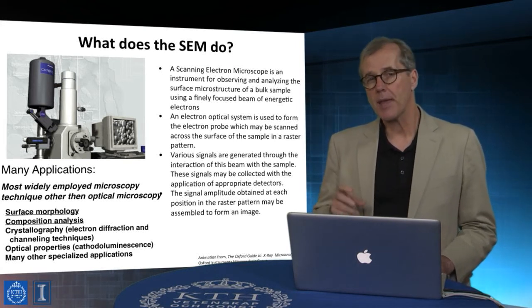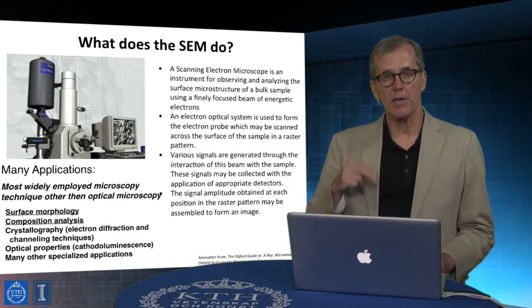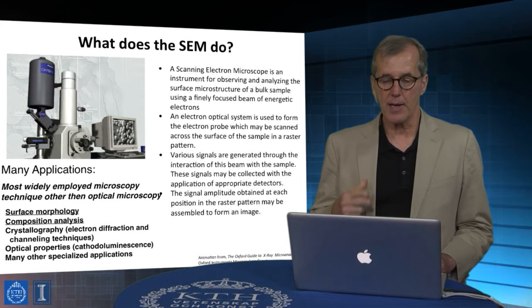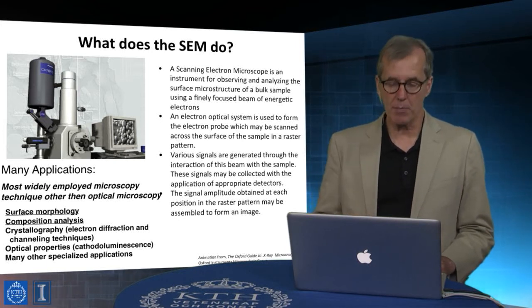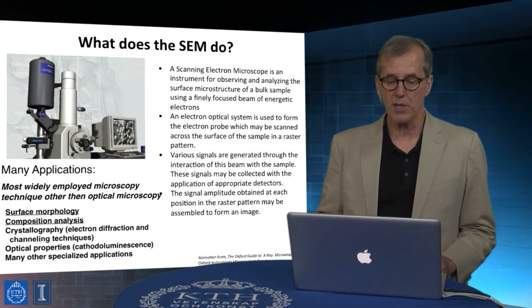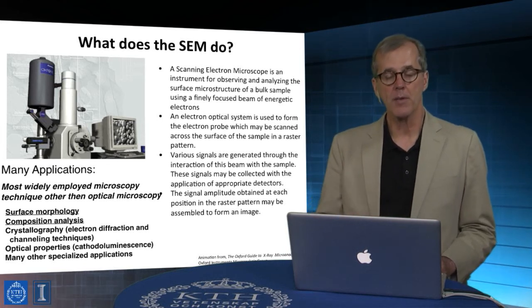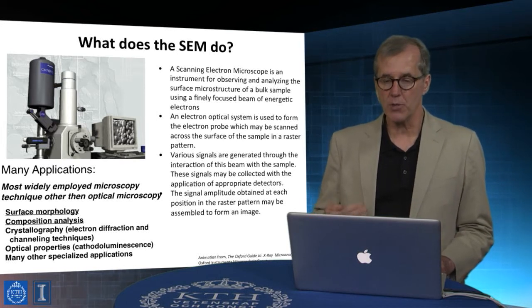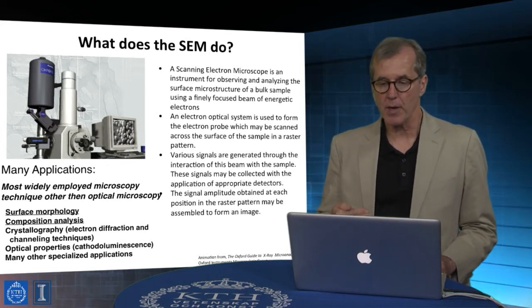This is a measurement that is fundamentally not a surface analytical measurement, but it is in fact one that is very much capable of producing topological characterizations, that is, profiles of height, depth, and in correlated forms of measurement, issues related to composition.